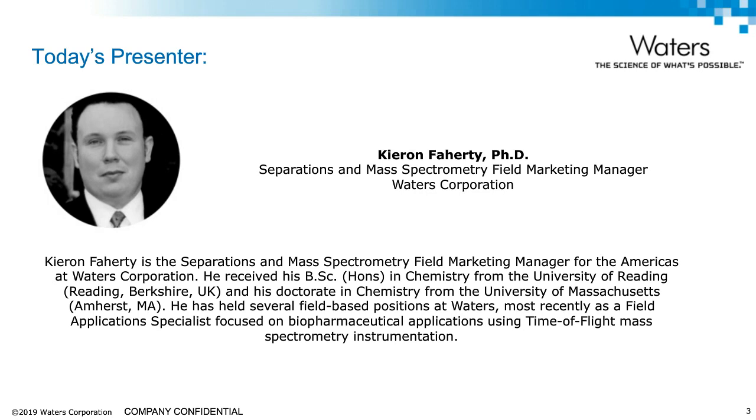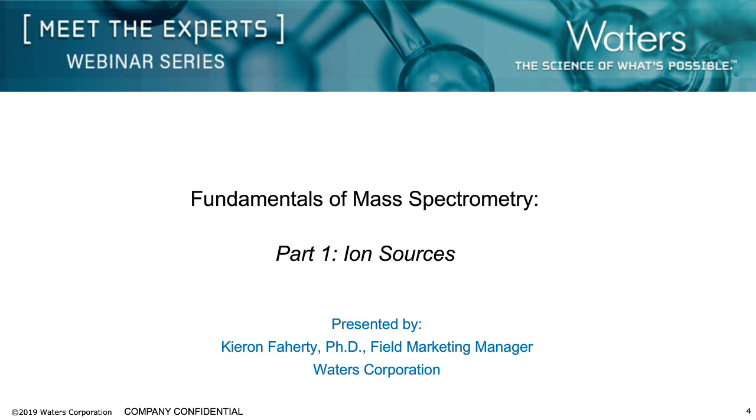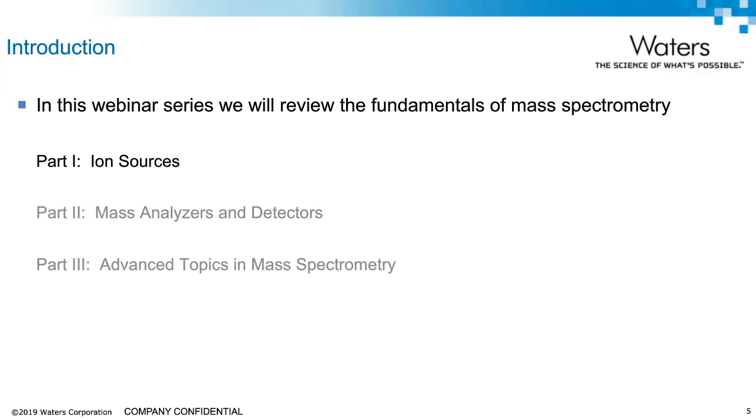I'd like to welcome you to part one of this three-part webinar series covering the fundamentals of mass spectrometry. The goal of this series is to provide you with some background on mass spectrometry and to help you become familiar with the systems and technologies available today. In today's session, we will look at ion sources that are commonly used in mass spectrometry. Future sessions will cover mass analyzers and some advanced topics in mass spectrometry.